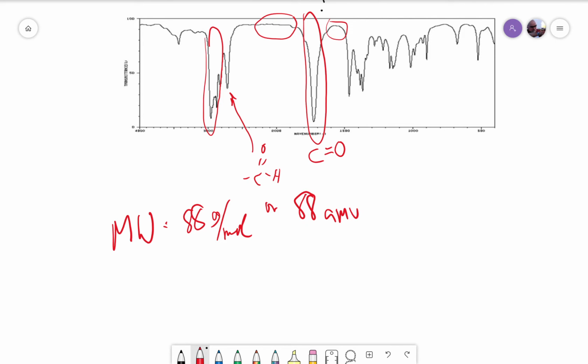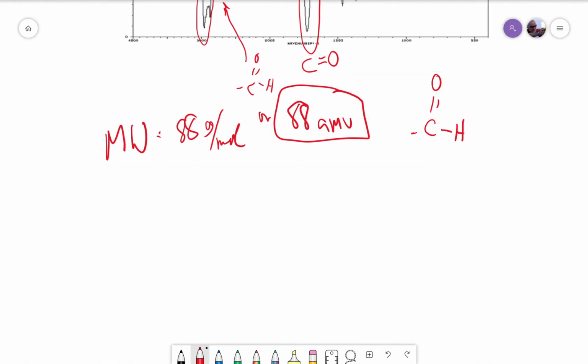You do that based on the fact that you know you have 12, and then you have 16, and you have 17, and then you'd start trying to figure out how many other carbons and hydrogens you might have and what kinds of things might exist. You could come up with a short list of things that might fit that bill, but it would be difficult to say the least. But you could certainly narrow the list, given at a minimum the molecular weight.